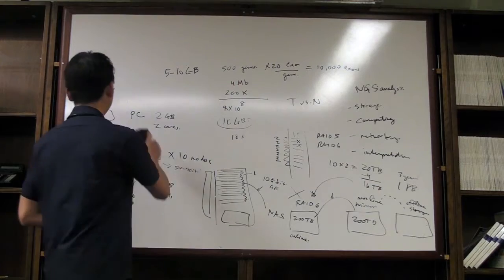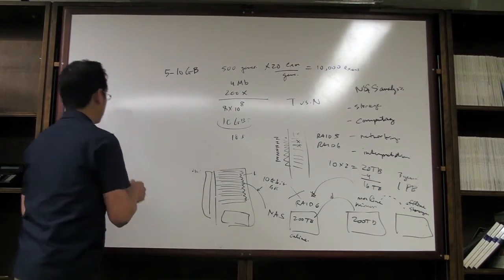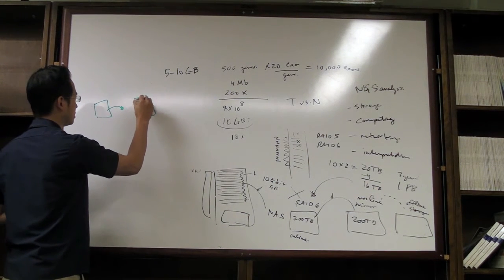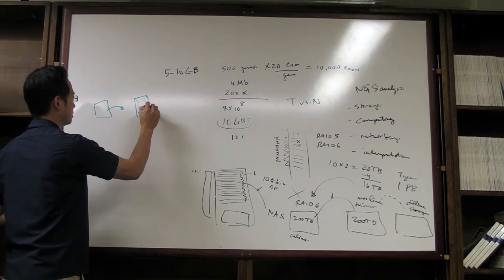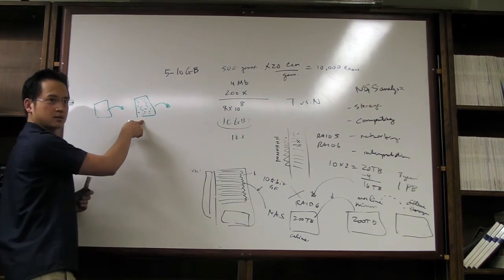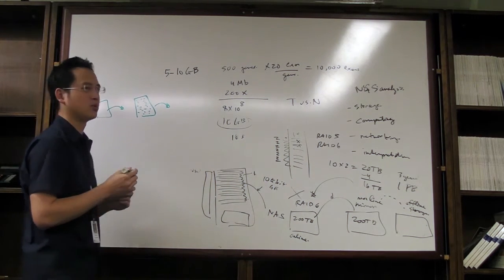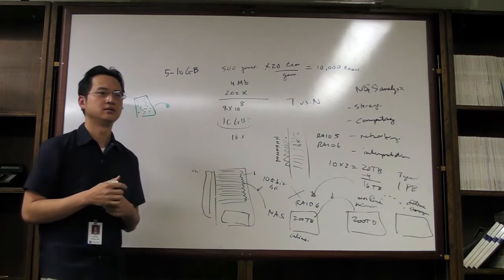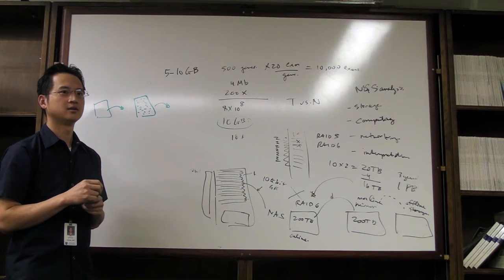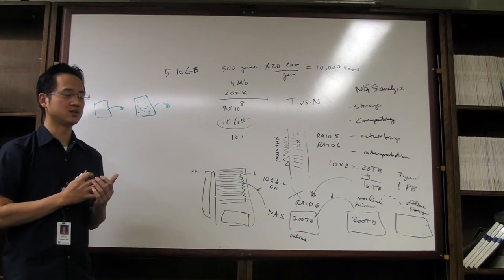Right. So you're talking about, you do your sequencing, and then it spits out an image of those dots. You want to bypass this somehow? Either that, or the mapping part too. Even the mapping part. Yeah, you're obviously converting that to zeros and ones, something the computer understands. I don't know about computing, but I wonder if there's some way to encode that. It's possible, because that's always the fastest, right?